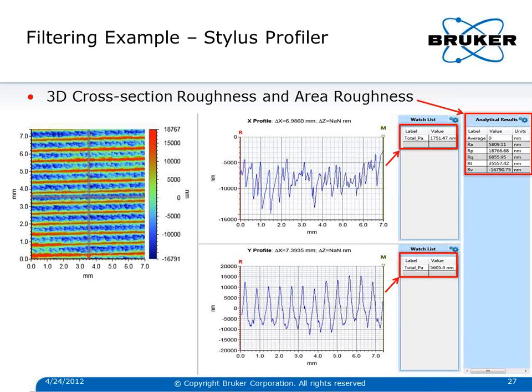But if we go across those multiple peaks, and the peak values are much higher, our roughness value is on the order of over 5,000 nanometers. So again, just by doing a single profile across the sample, you're going to get very different numbers depending on where the stylus tends to land. So by doing three-dimensional analysis of a surface like this, you get much more information.